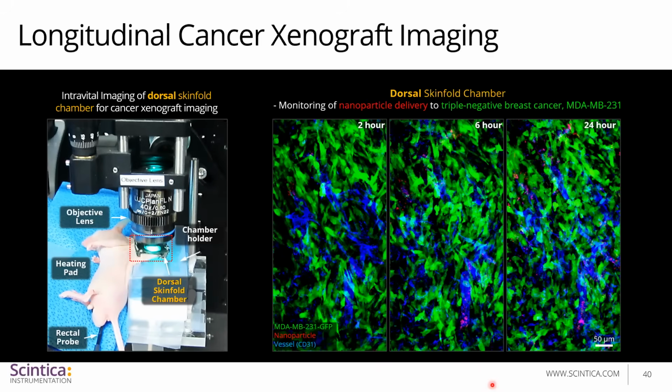You cannot very well appreciate how many red nanoparticles are present and where they're located because of the green cancer cells that are larger and brighter, as well as the nanoparticles. So in order to visually appreciate where the nanoparticles are at and how many there are, we can simply remove the green channel from the other ones and only look at the red and the far red channel.